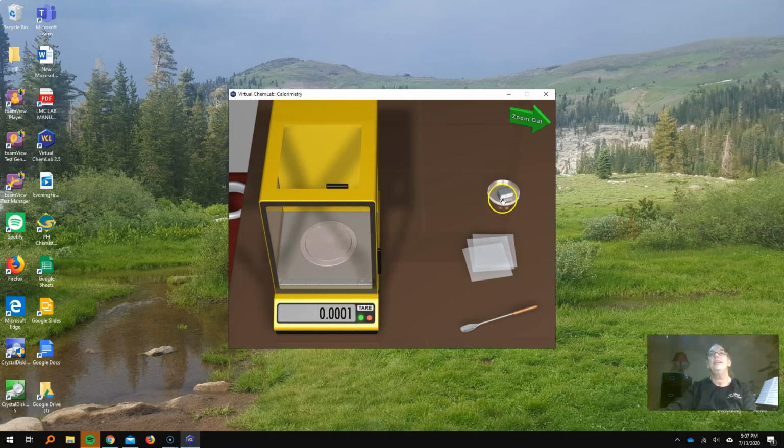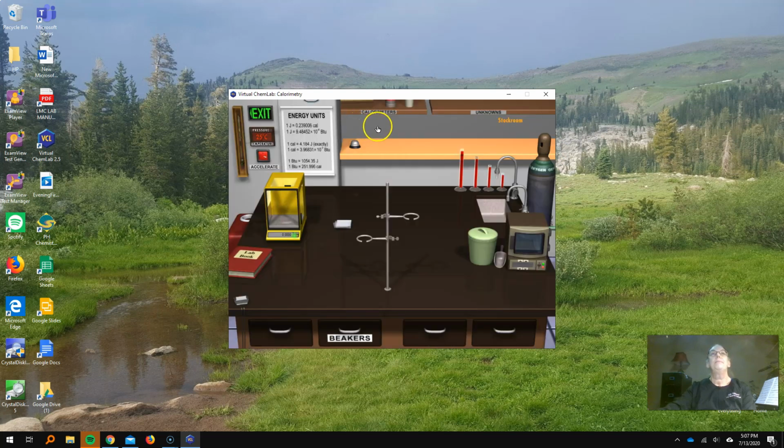So remember, it's 0 tared. It's okay if it goes up and down a little bit. Air in the lab makes it move a little bit. We'll hit tare again, but it's okay if you have a number in that last place, because air movement and any vibrations will make it change, and that's okay. So now we're going to put the lead here. We're going to weigh it. Please put that weight down in your mass for lead in grams. So this is grams right there. All right, so write down that number, and we will move on to uranium.